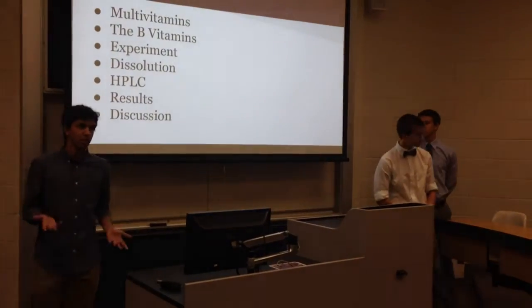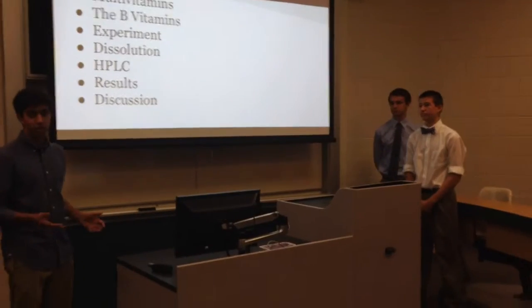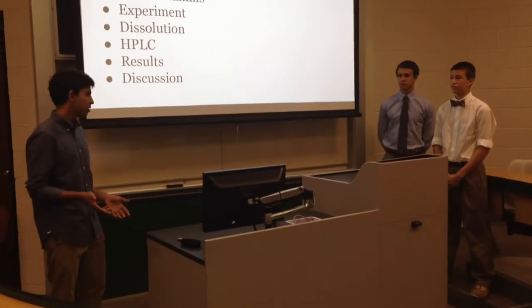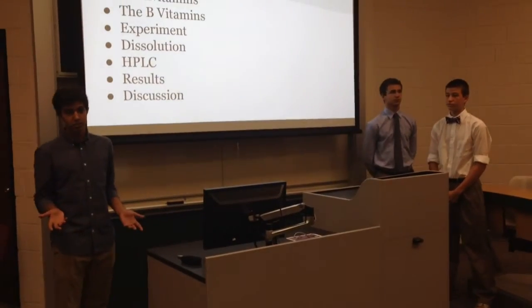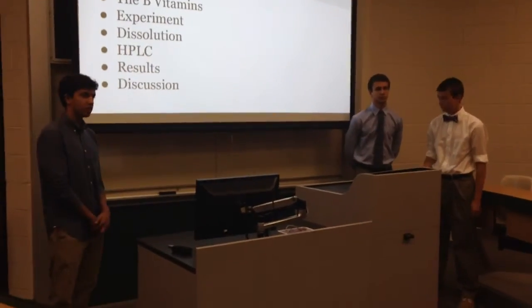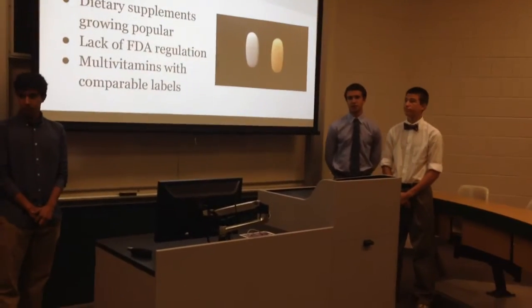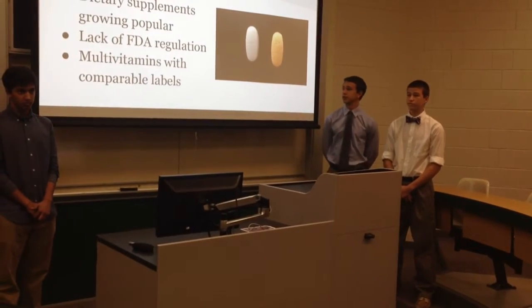So today we'll be talking about multivitamins in general, and then we'll be discussing the specific B vitamins we focus on in this experiment. And then we'll talk about the instruments we used and finish up with the results and discussion. So, dietary supplements are growing more and more popular in America.